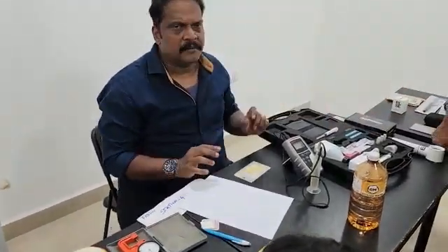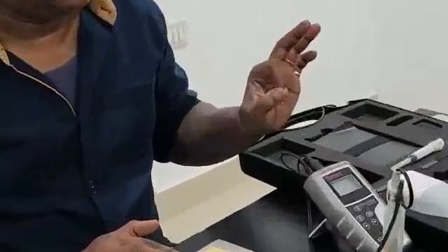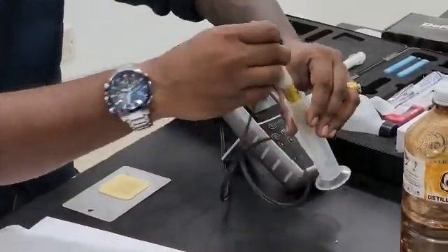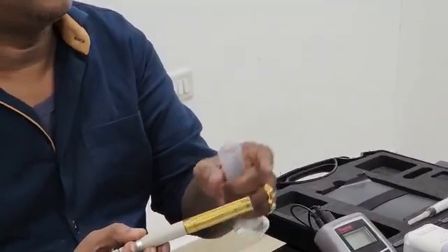For this test, regardless of what type of conductivity test you have done previously — whether you used an Elcometer SCM 400 or other methods — for this demonstration we are going to check the conductivity using this Thermo Scientific meter, which is very accurate. This is your probe.